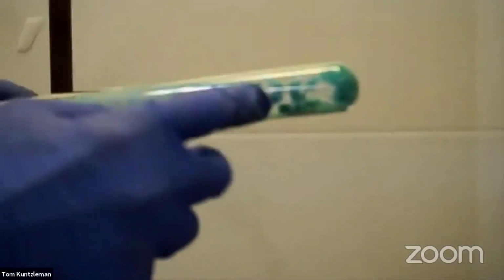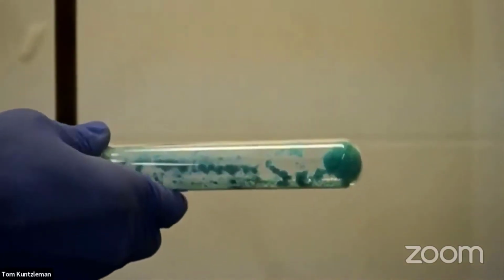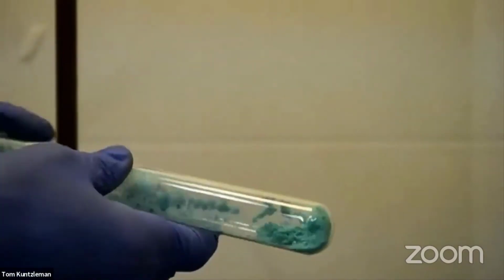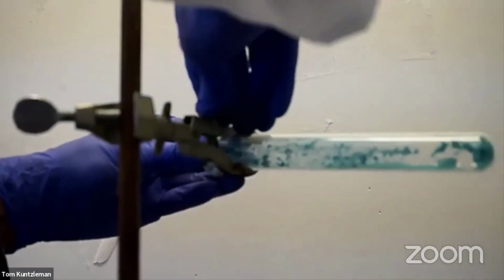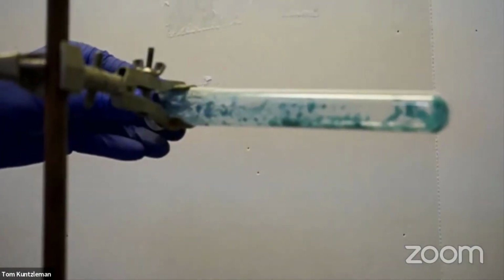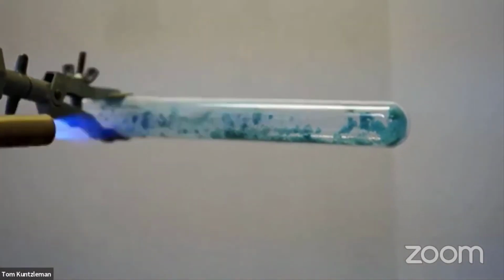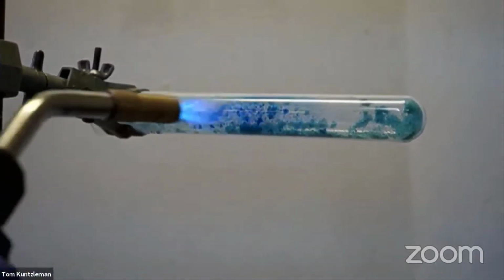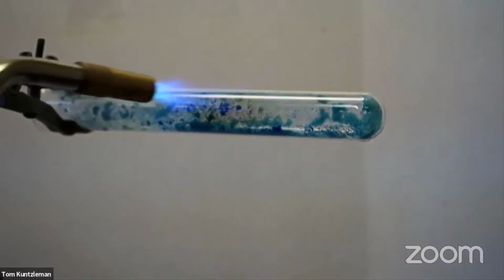I'm going to try to shake it around here a little bit to get it coated all over the inside. And what I'm going to do is heat this. I'm going to heat the copper formate. We're going to see what happens. All right. Let's try to stir that up just a little bit better. Okay. Pop it back in there and get it flatter. We'll heat this and see what happens. Hope for the best. All right, we set? Here we go. Well, looks like I got a little darker in color. Let's keep going, see what happens.